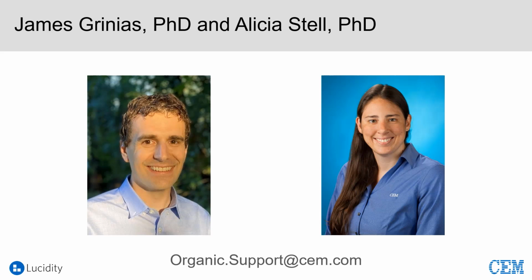Okay, thank you. The next question is, have you used this system for other applications outside of pharmaceutical analysis? Oh, great question. Yeah. So today, with the time we had, I figured to primarily focus a bit on pharmaceutical separations, but we have used the system for a few other applications that we're interested in. So we do have some interest in using small systems for the separation of drugs of abuse in various clinical samples. So we have done some testing on mixtures of benzodiazepine drugs using the miniLC. And then we've done a few other things here or there. We did do a quick test for capsaicin. And then we've also done some other pharmaceutical separations that I didn't talk about here today, in this same sort of monograph type realm.